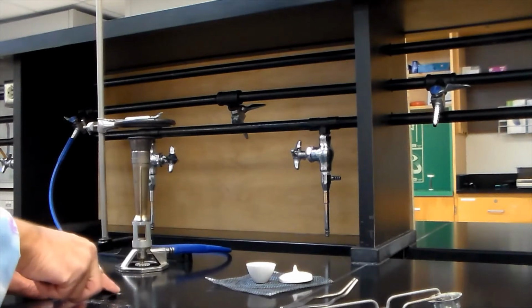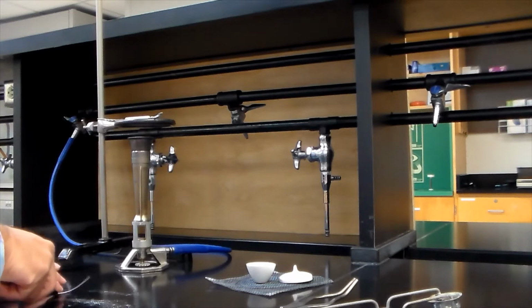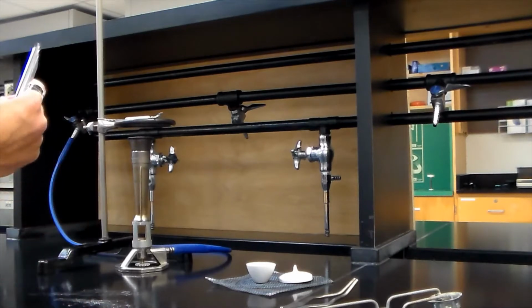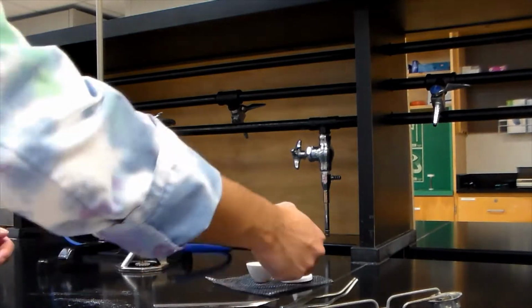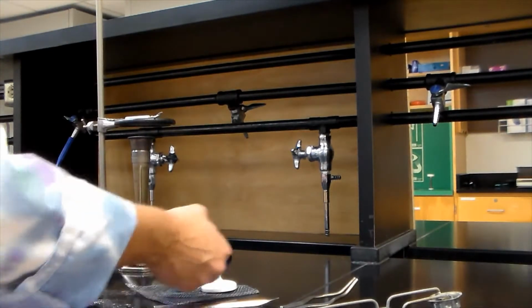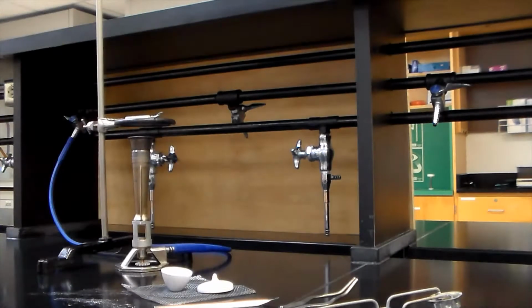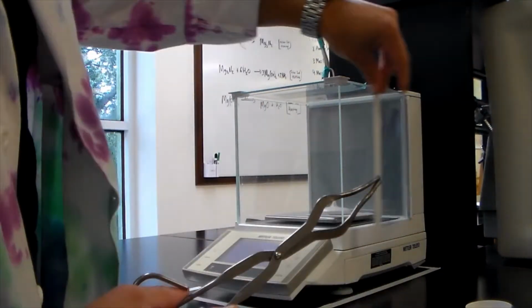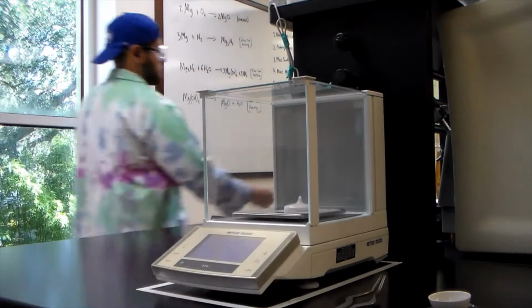To determine if the crucible is at room temperature, place your fingers as close as possible to the crucible without touching it. If heat is radiating from the crucible, allow it to cool for another 2 minutes. After heat is no longer radiating from the crucible, you may test the temperature with a finger wrapped in a Kimwipe. Do not weigh a warm crucible. Using crucible tongs, place the cool crucible and lid on the balance to record the combined mass. It is strongly recommended that you record the mass of the crucible and the lid separately.